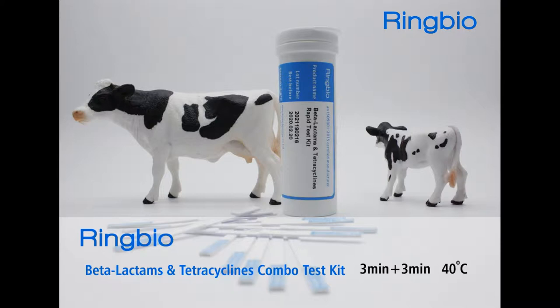Welcome to Ringbio's training video for our BT combo test kit. This kit is a two-step 6 minutes test to detect beta-lactams and tetracyclines antibiotic residues in milk. Incubation at 40 degrees centigrade is required.